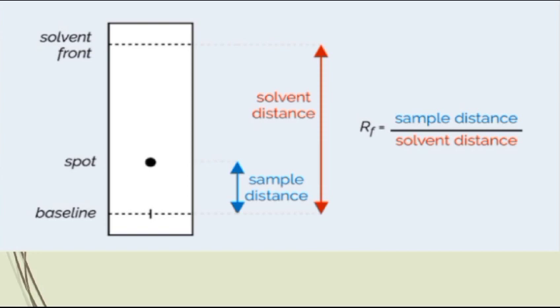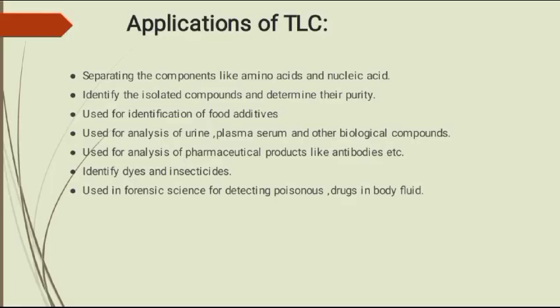Formula of RF value: sample distance over solvent distance. This diagram shows that from the baseline to the spot is the sample distance and from the baseline to the solvent front is the solvent distance. Applications of thin layer chromatography.